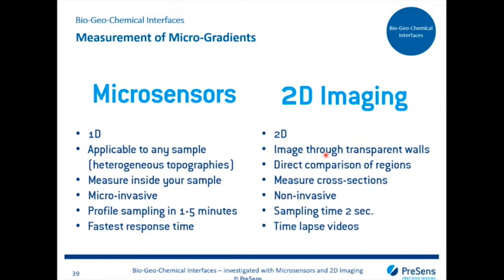The whole system can, after being set up, be non-invasive and left there for incubations, for example, in rhizotrons or growth of roots, sediment cores or whatever, for extended periods of time. And it allows you to record those time-lapse videos. So you can take an image about every 2 seconds, and these images you can then stitch together to continuously monitor and create the nice video images Robert just showed us.